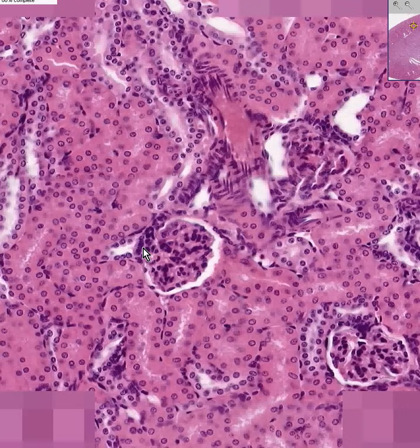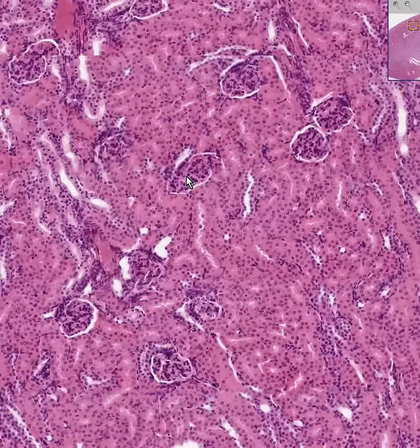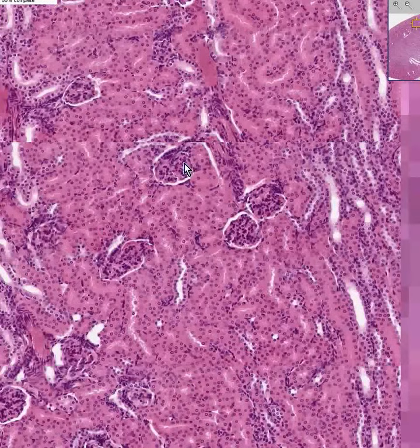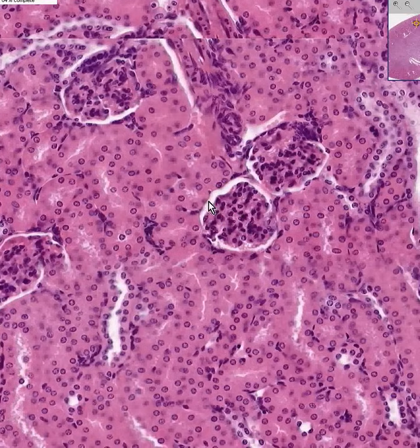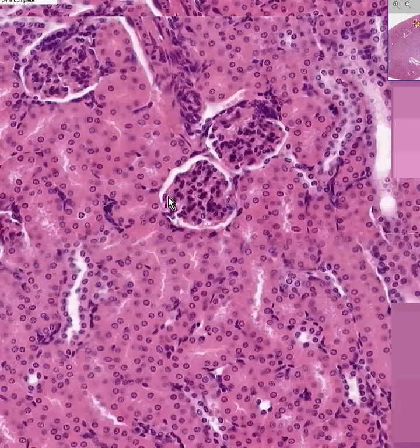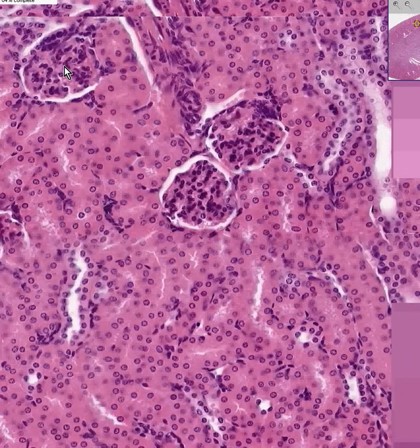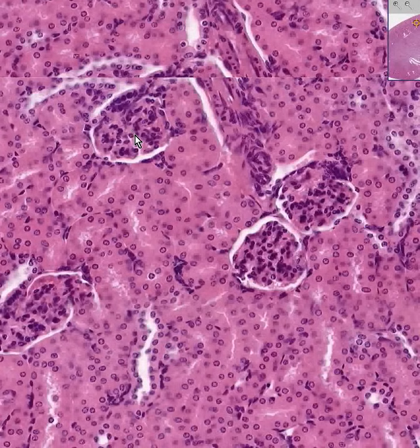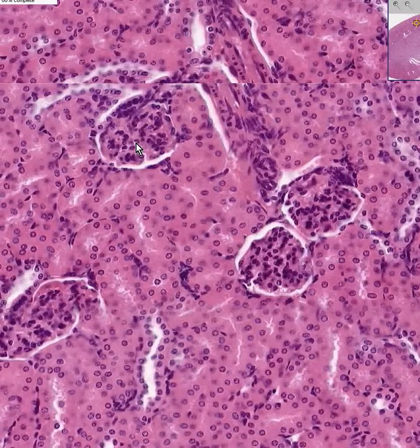Looking at a glomerulus, there are only three kinds of cells within it. One type is called podocytes, also known as visceral Bowman's epithelium — they are on the inside lining the capillaries. The parietal Bowman's epithelium lines the outside of the Bowman's space. Another cell type, especially if it has a spindly shape with blood vessels, would be capillary endothelial cells.